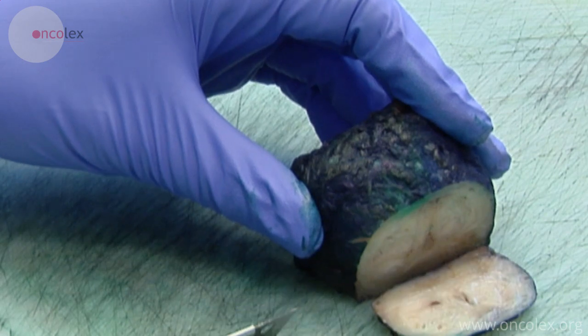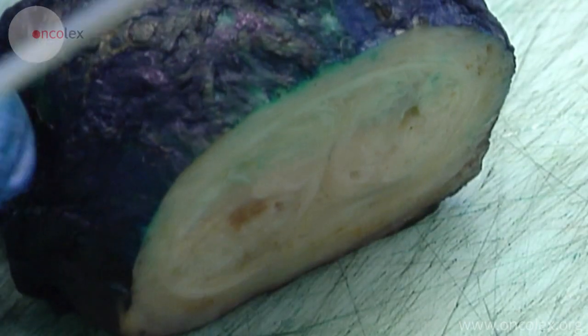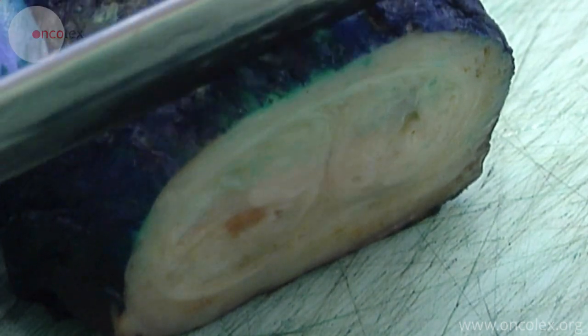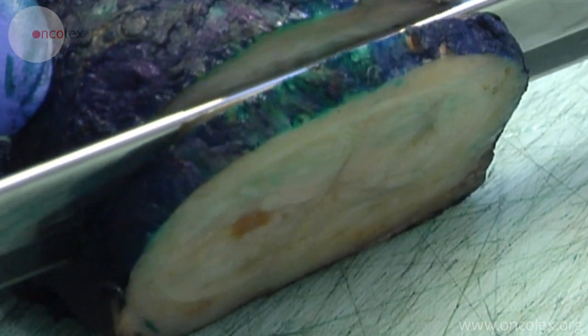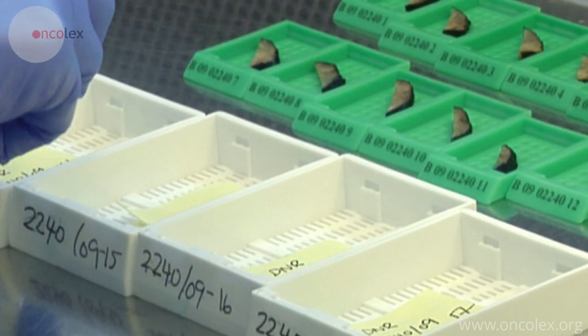The main part of the prostate is cross-sectioned from the apex to the base. The cross-sections can be correlated with preoperative MRIs. The cross-sections are placed in large containers.